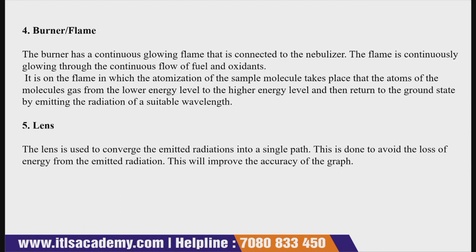Okay, now comes the lenses. So what is the use of lenses? The lens is used to converge the emitted radiation into a single path.